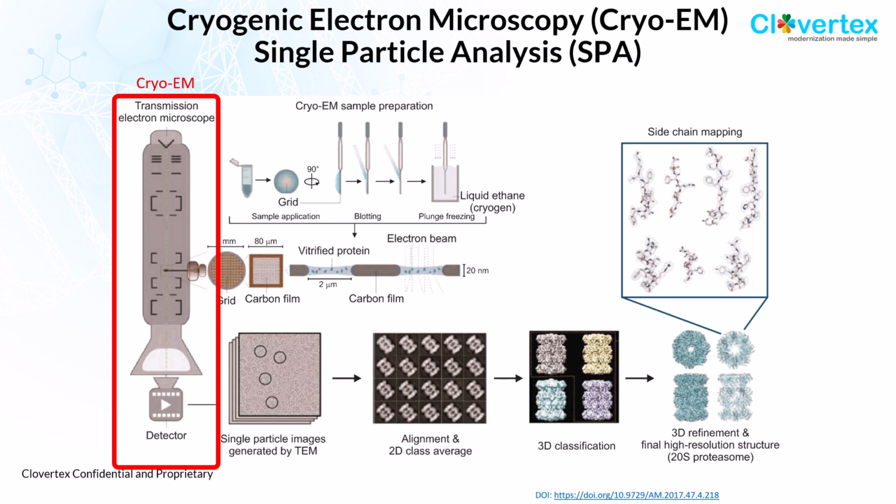So the cryo-electron microscope here that we show in the red rectangle is actually a very special transmission electron microscope, with which we can keep the specimen at a very cold temperature, usually a liquid nitrogen temperature, so that the damage to the sample by the electron beam will be reduced compared with room temperature.